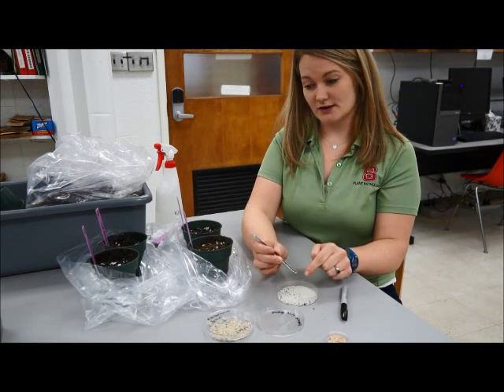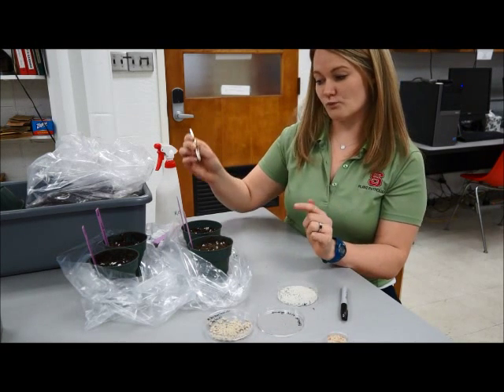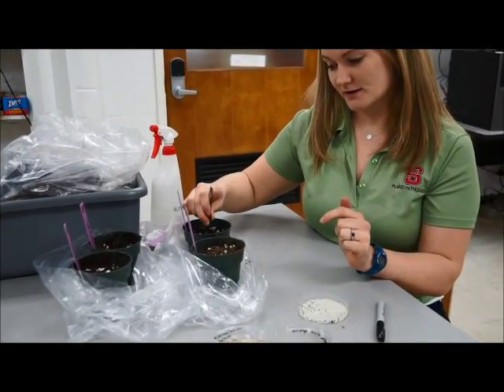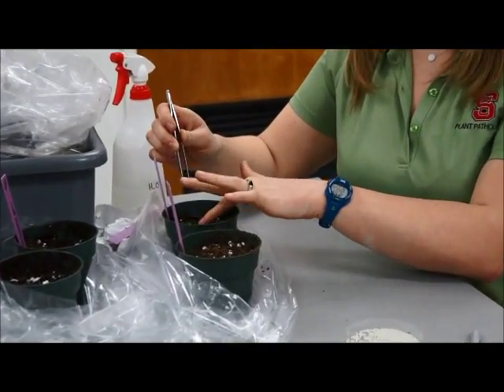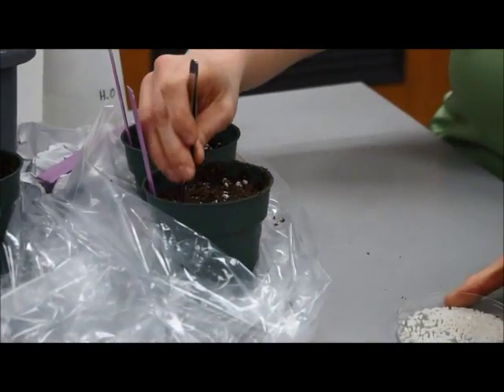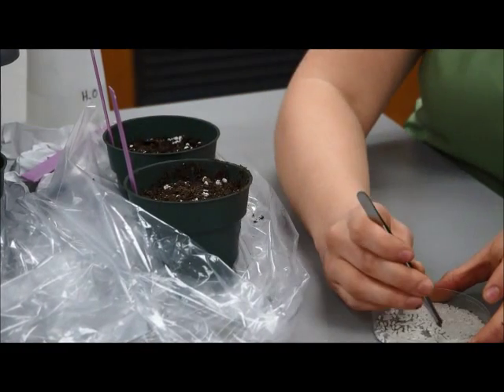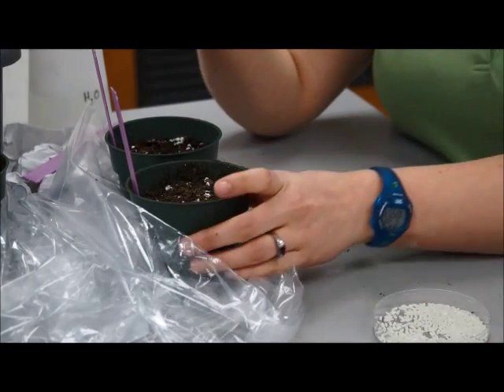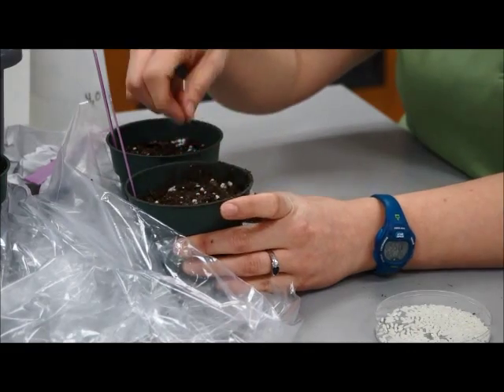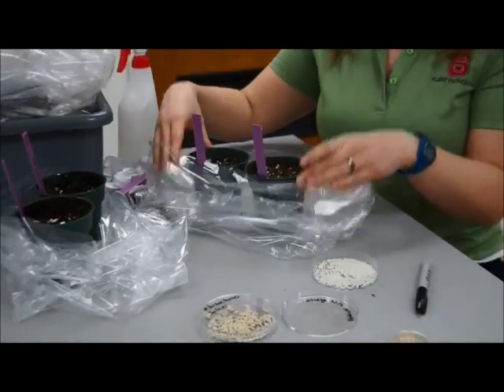We're going to work with the sterile rice grains first because we don't want to cross-contaminate. For the pot labeled one, place one sterile grain in the center of the pot, one centimeter down, then cover it up. For the other pot, we're going to do three rice grains, placing them in a triangular pattern into the media, one centimeter down, then cover them up. The controls are now done.